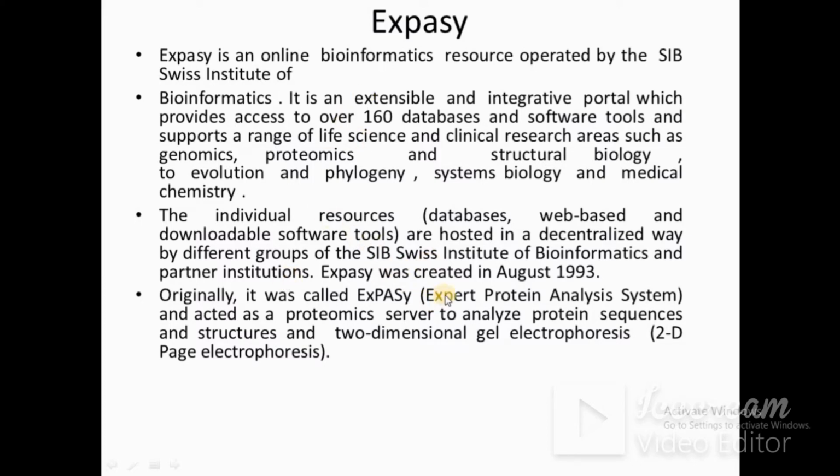This was first created in August 1993. Originally, it was called ExPASy, meaning Expert Protein Analysis System. It acted as a proteomic server to analyze protein sequences and structures and two-dimensional gel electrophoresis. So we can analyze primary, secondary, and tertiary structure all through Expasy tools.